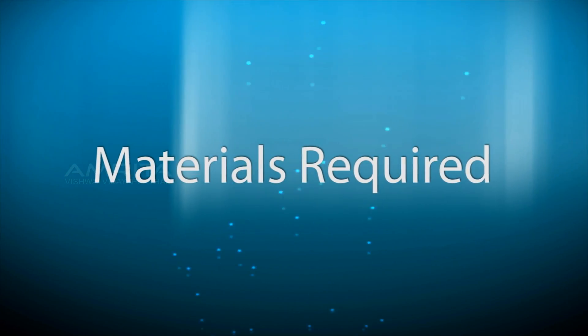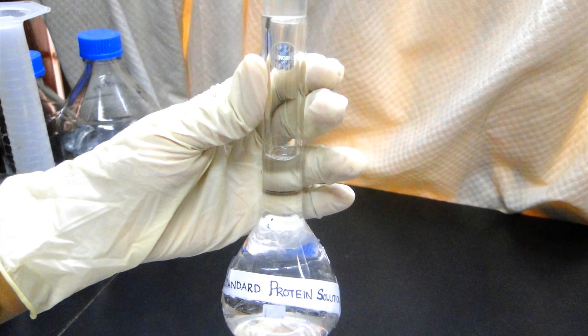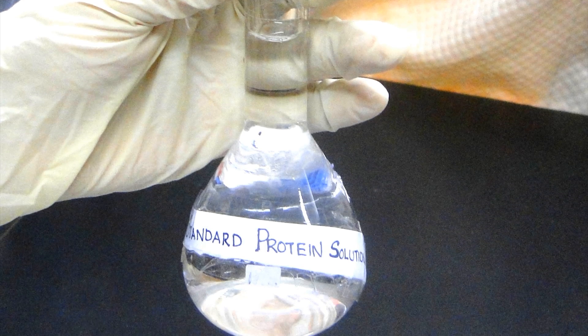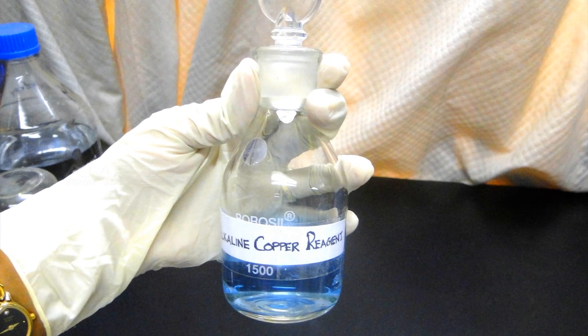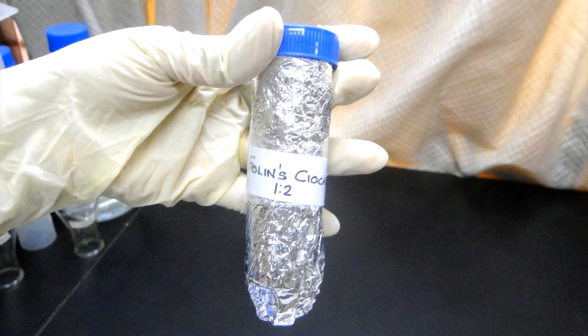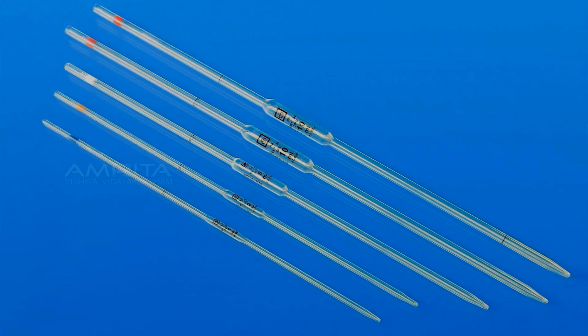Materials required: Standard protein solution of 200 microgram per milliliter, alkaline copper reagent, Folin Ciocalteu reagent, colorimeter, pipettes.